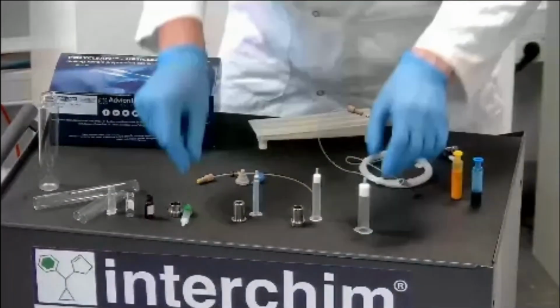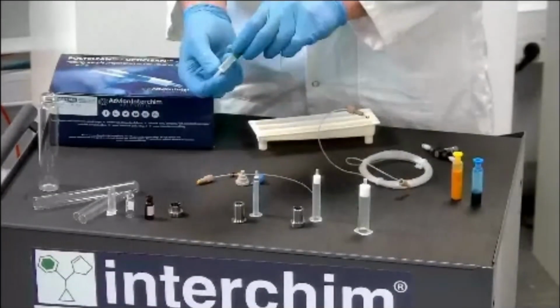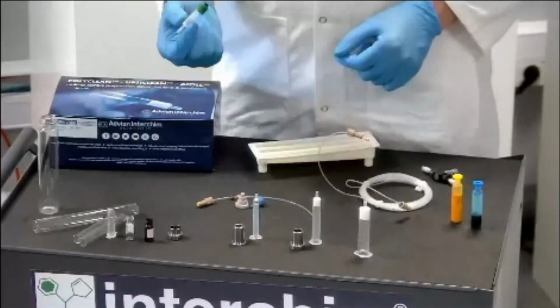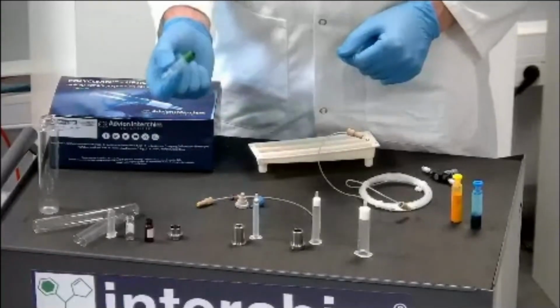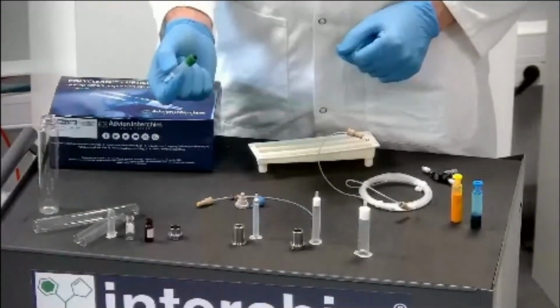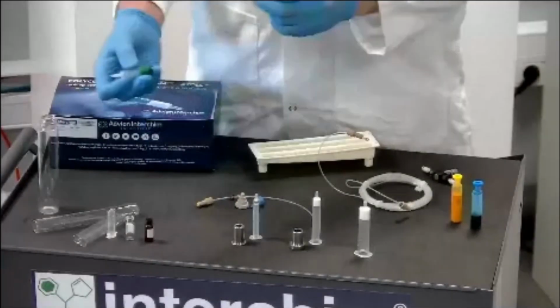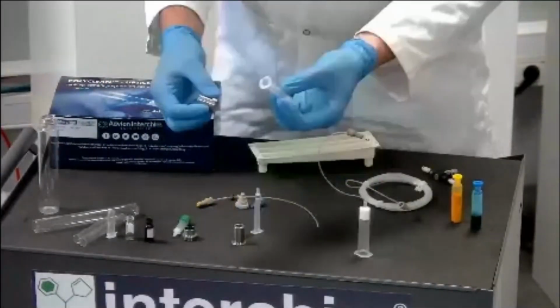Another possibility is to use FPLC columns 1 ml. This column is important especially for desalting, for example, or for protein and peptide purification. For these ones, we have other adapters. For example, I want to use SPE columns 3 ml.